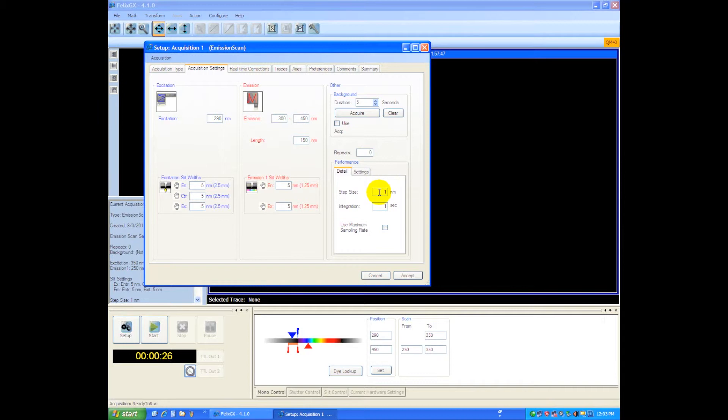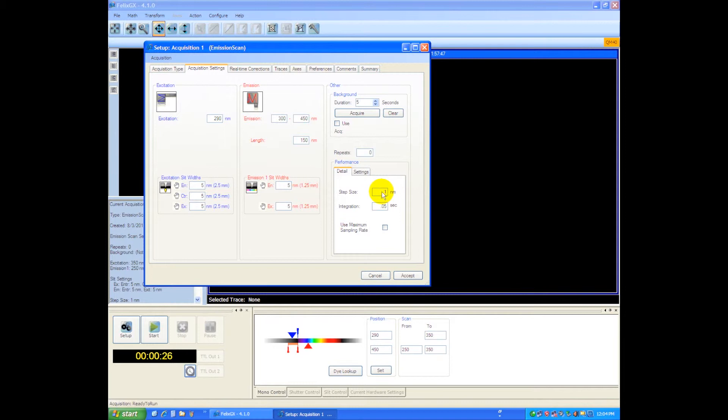Next we'll choose the integration time, and you can see here we'll go say 0.05 seconds at each wavelength. So the monochromator will go to 290, integrate for 0.05 seconds, and then move on to the next wavelength in a one nanometer step size. This can be set from anything from about a quarter nanometer on up, and we're now ready to start that scan.